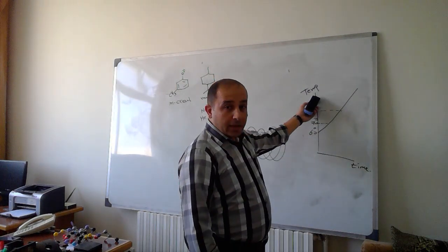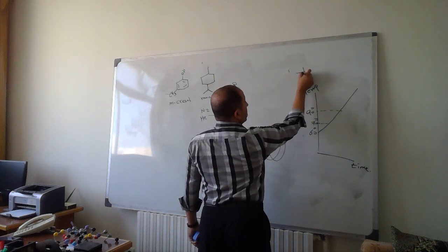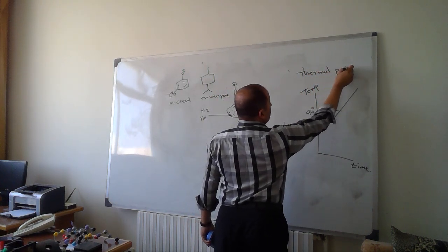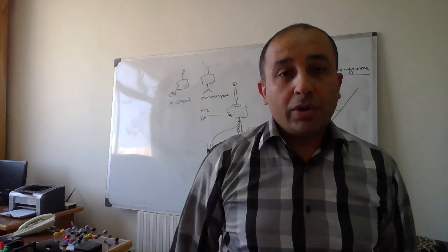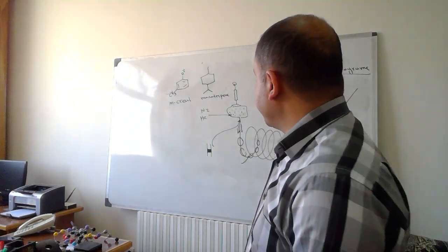Thermal programming will utilize the variation in volatility in order to get the analytes separated.